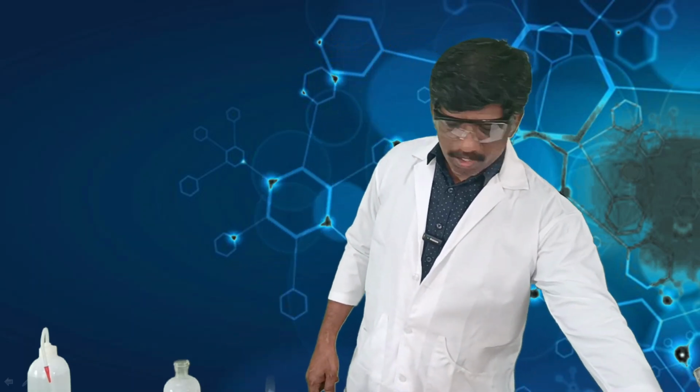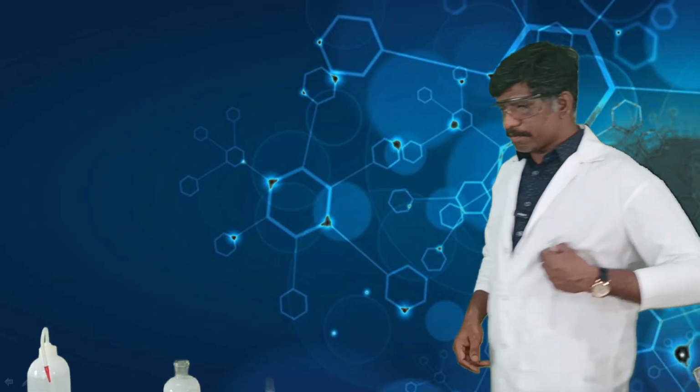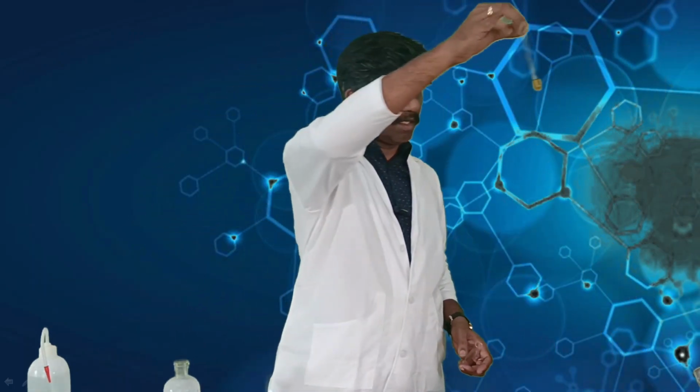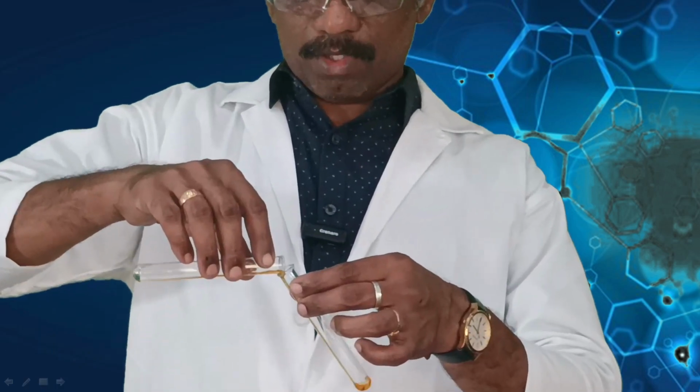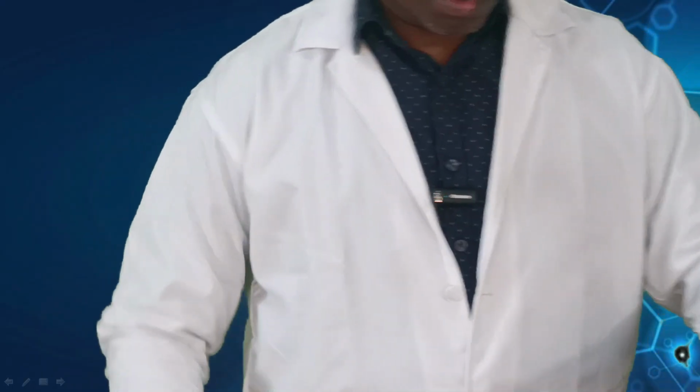Okay. Next we shall see the action of concentrated HCl test, and this test is to detect the presence of amine or organic bases. In the same way, you can take your substance. If your compound is an amine, it will be dissolved in HCl. If you add HCl, it will get dissolved, and if you add NaOH, it will get reprecipitated.